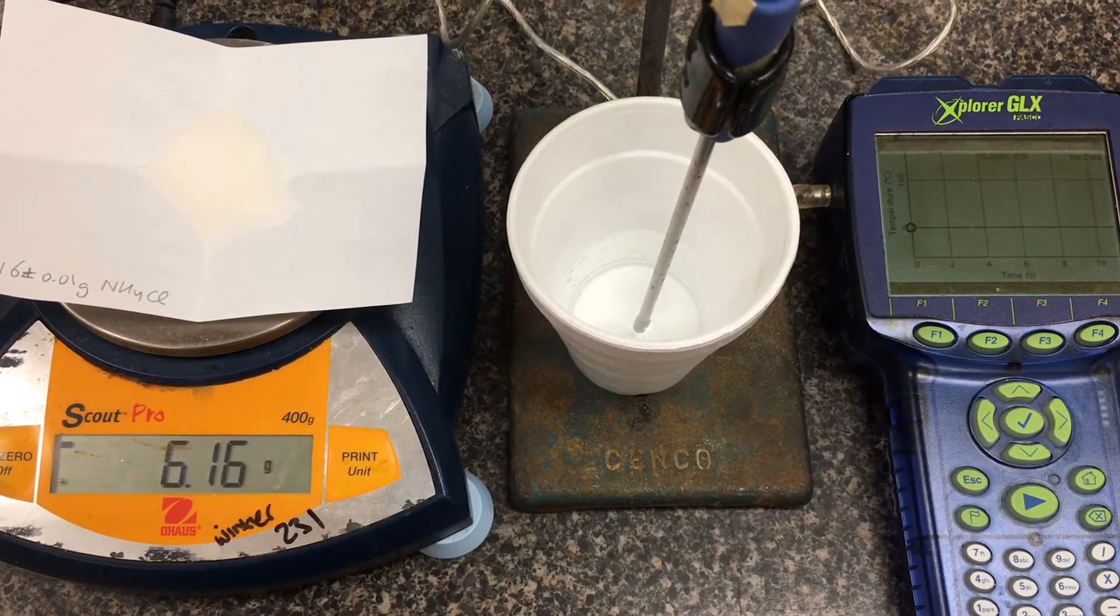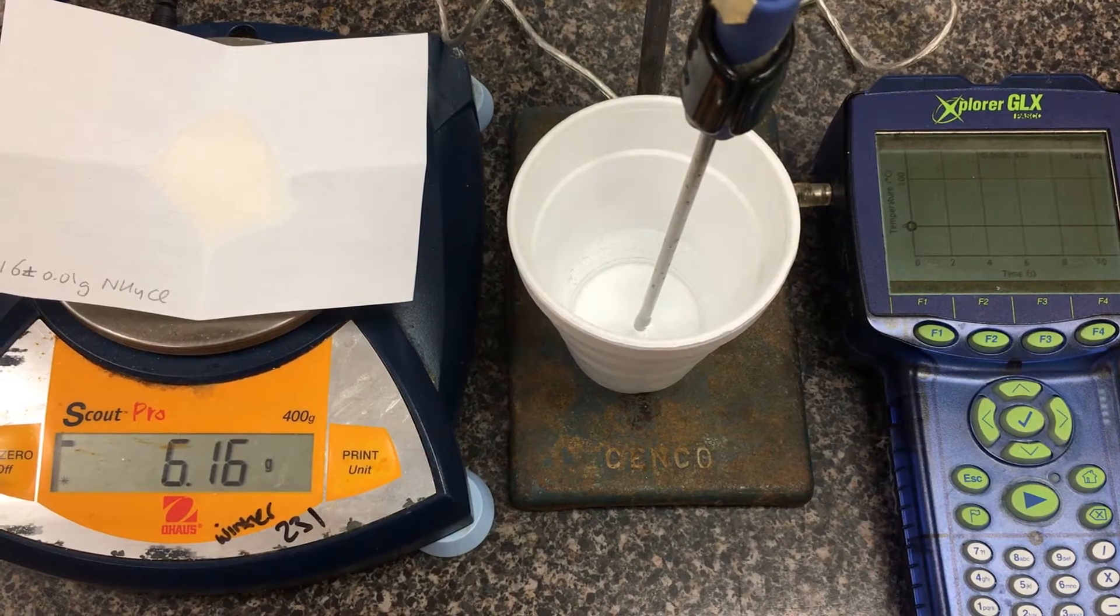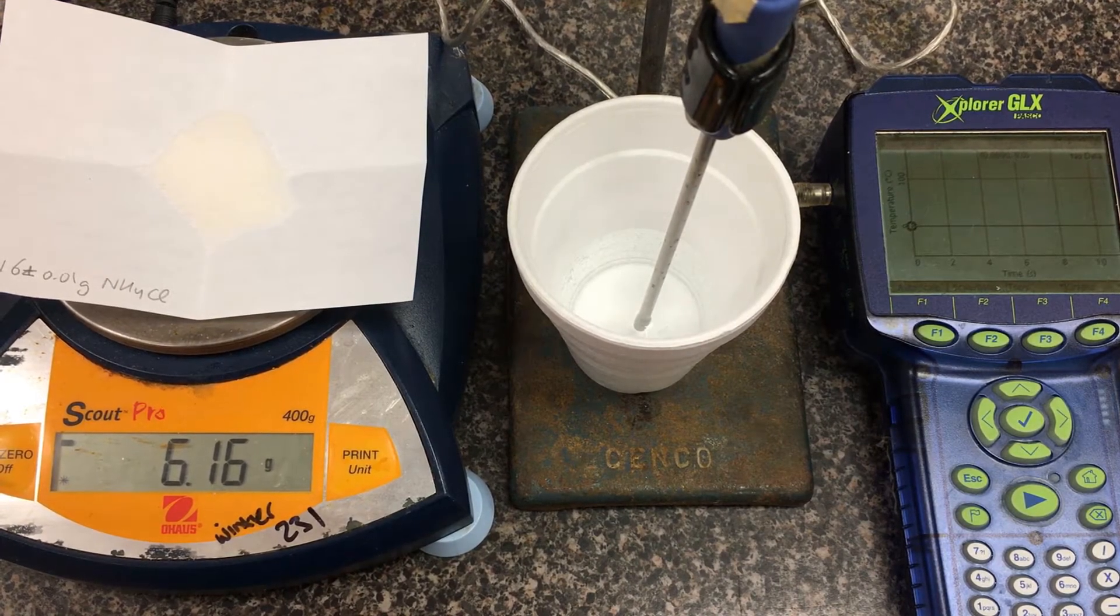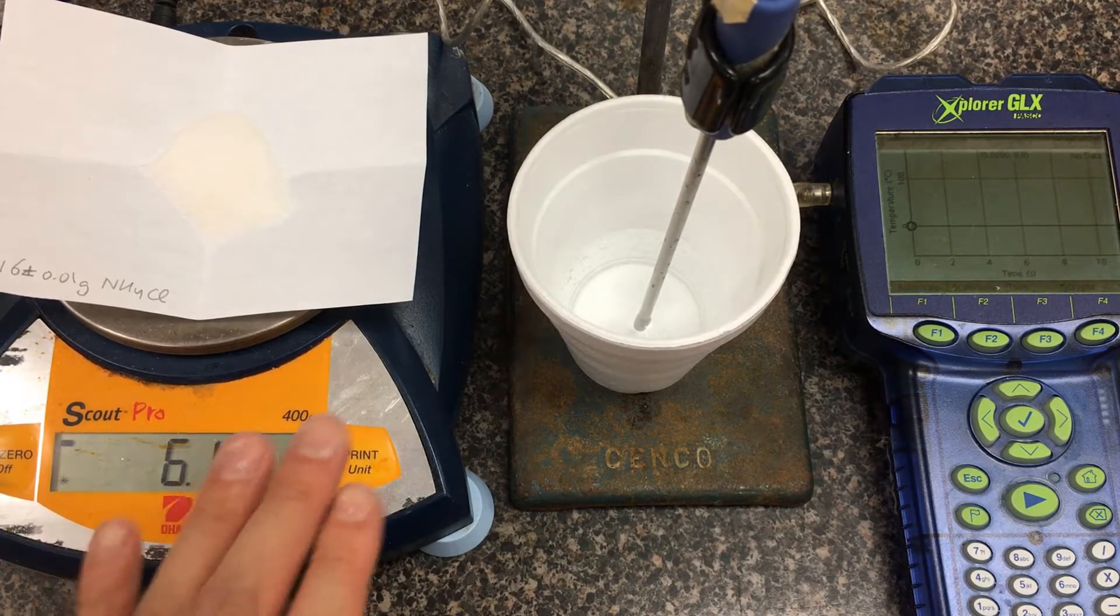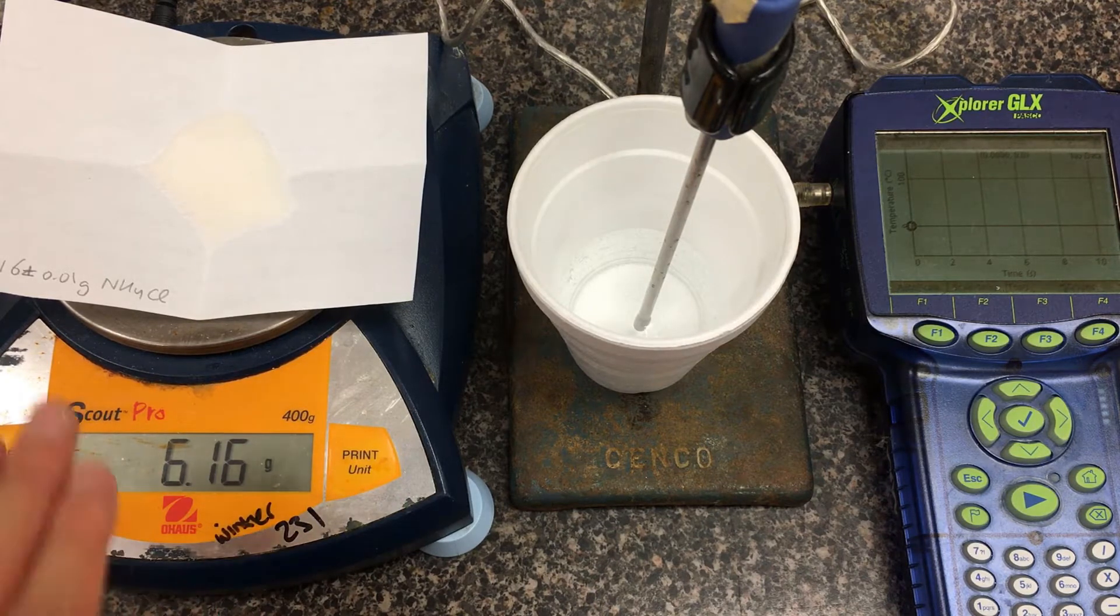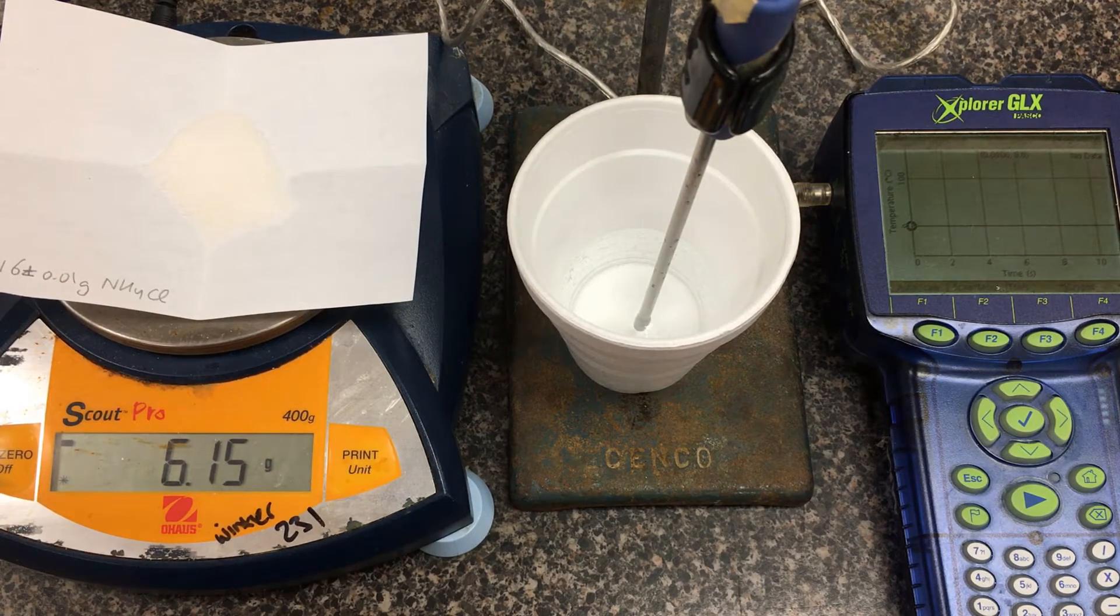In this lab, we're going to be determining the enthalpy of solution using a calorimetry experiment. The salt we're examining is ammonium chloride. I've already removed the mass of the paper, so this is 6.16 grams of the powder plus or minus 0.01 gram.